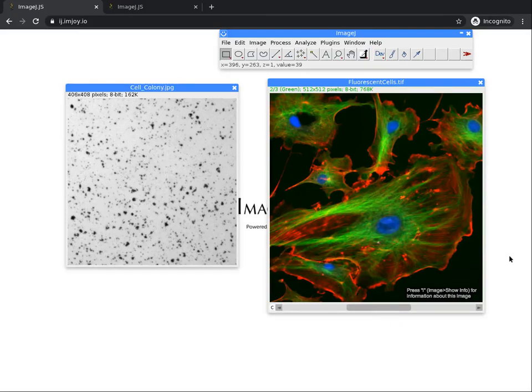Congratulations! In this task, you have modified the brightness and contrast of your images to be analyzed. In the next task, we will talk about multi-channel images.